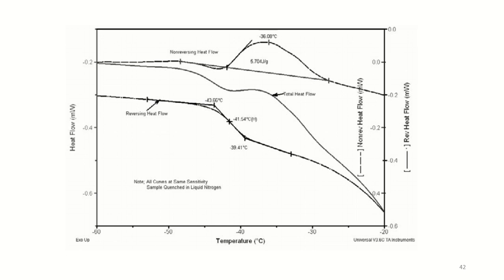are the purity of the compound, and it gives sharp temperature measurements in a wide temperature range.